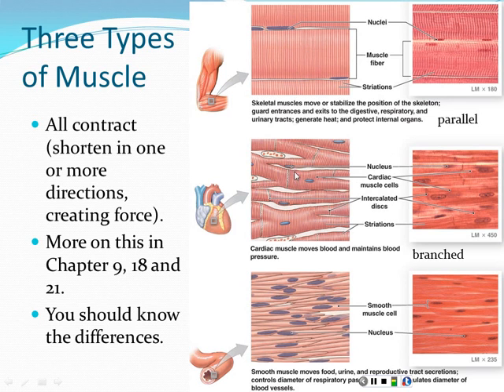In cardiac muscle, okay, we see striations here, but we see not parallel fibers, but branching fibers. So if you look at skeletal muscle, you'll never see a branching like this, where 2 come together, and here's one where there's a Y, where 1 splits apart. So cardiac muscle branches, and there's only 1 nucleus per cell. So if you see a muscle sample, and you see branching fibers and 1 nucleus per cell, you know that's cardiac muscle, not skeletal. These are the 2 that get confused most easily, skeletal muscle and cardiac muscle. Because smooth muscle looks very different than these others.